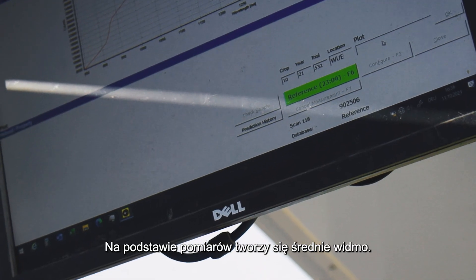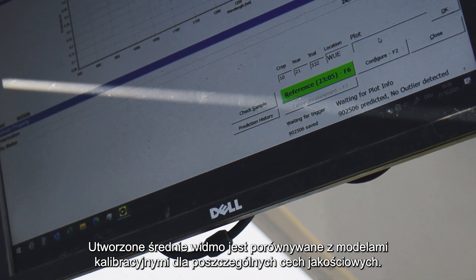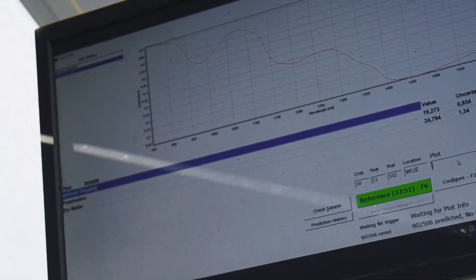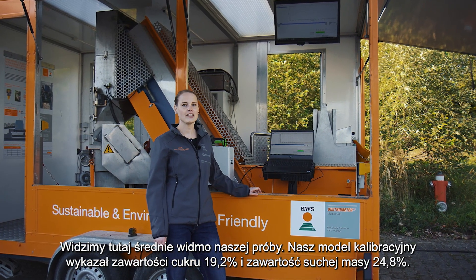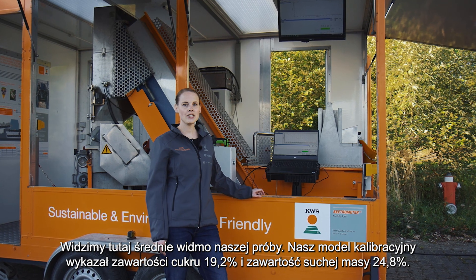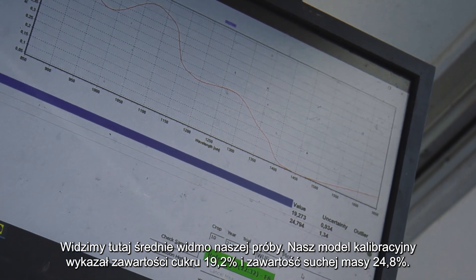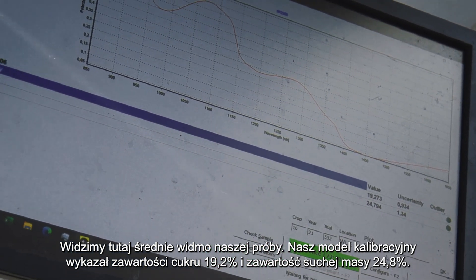The spectra are filtered and an average spectrum is calculated. From this average spectrum, the quality parameters are predicted with our calibration models. What we see here is the average spectrum of our sample. With our calibration model, we predict a polarization of 19.2% sugar content and 24.8% dry matter content.